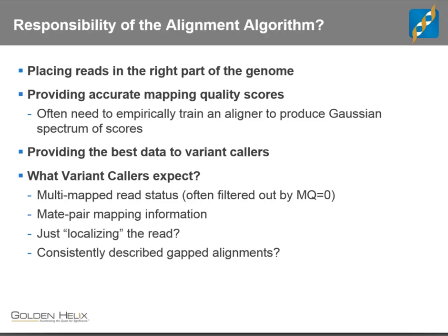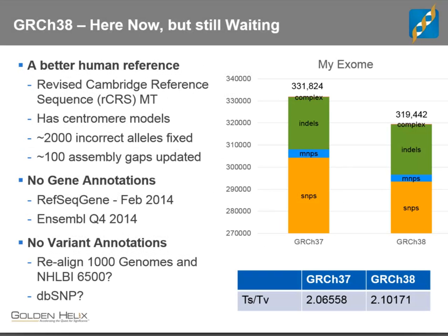Remember, an alignment algorithm takes one read, uses a giant index, places it on a genome, forgets about it, goes to the next read. A variant caller looks at a given region of the genome, looks at everything that's out there, and so it really ends up being its responsibility to account for all of these differences that we can see in ways that data is simply represented.